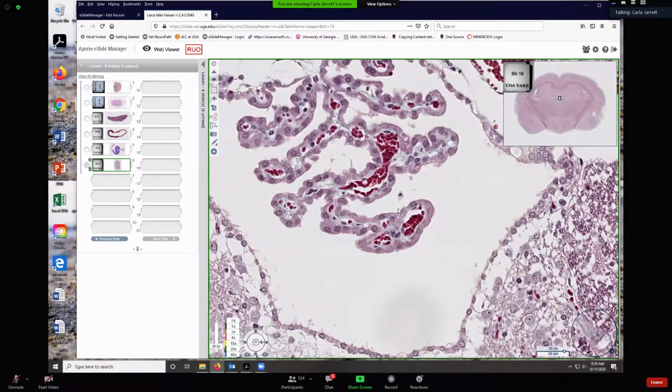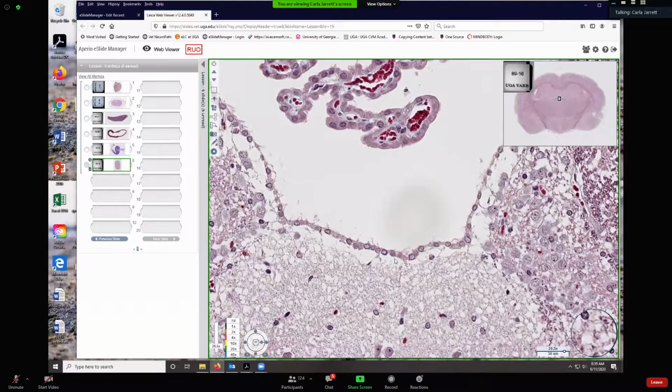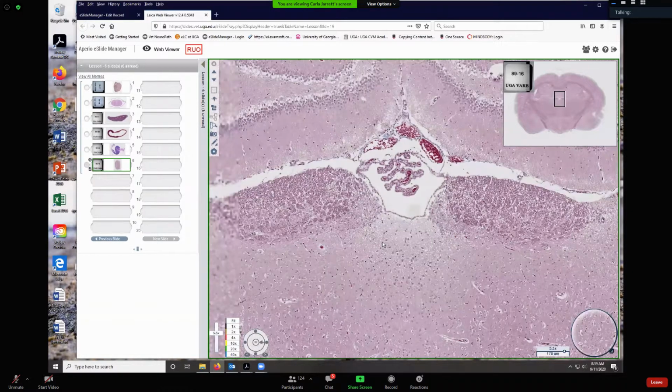These modified ependymal cells are not ciliated, but the ependymal cells lining the ventricles are ciliated, and they help form part of a protective barrier between the nervous tissue and the ventricles where the cerebral spinal fluid flows.